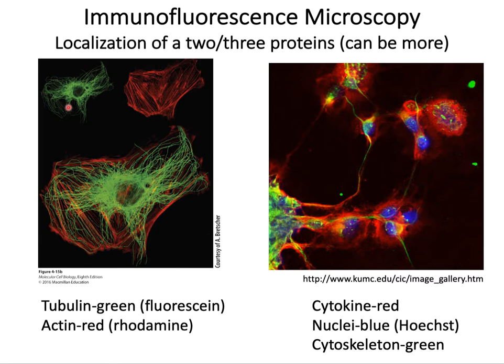The top left panel shows the fluorescent stained tubulin, which forms the microtubules in the cell. The top right is a rhodamine stained actin, which forms the microfilament of the cytoskeleton. The lower panel shows the electronically merged images. Please be aware you or the camera cannot see two or more fluorescent proteins at the same time, as you are using a filter to allow only one emission wavelength to pass. Here it is either green or red. When you see the beautiful dual, triple, or quadruple color images, they are all formed by electronically merging them. This is an important concept for your critical thinking questions.